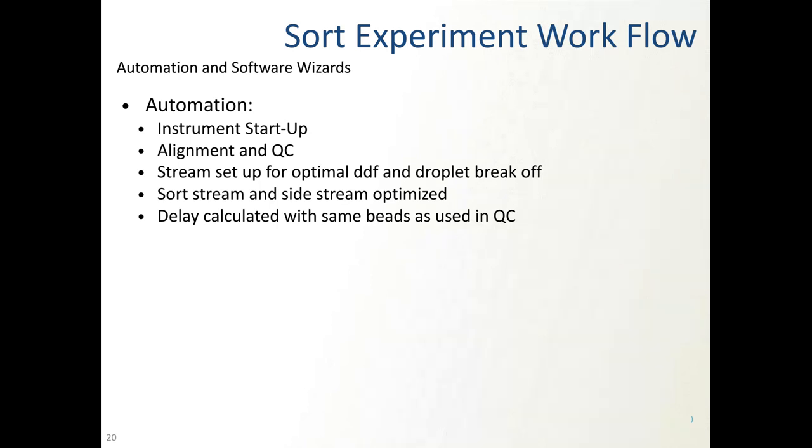And it can be as black box as you want it. You can do it in one click and never see, or you can get into the more service level menus and actually look at the camera images of all the different streams to make sure it looks good to you. If you really want to go down into the weeds, you can optimize the drive frequency combinations for better resonance and get it to be super, super stable. But so far in our hands, we haven't had to do that. The machine does a really, really good job of maintaining the stream.